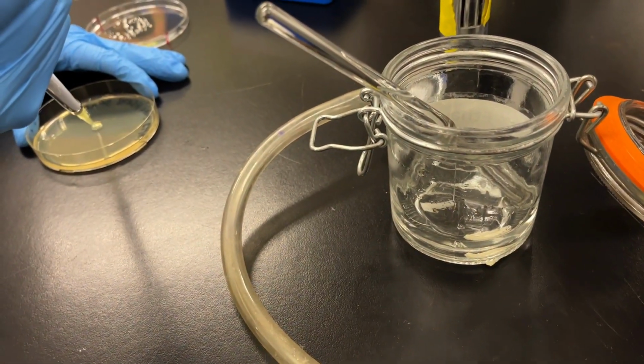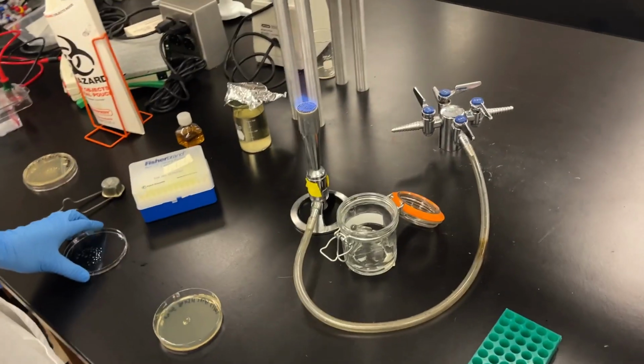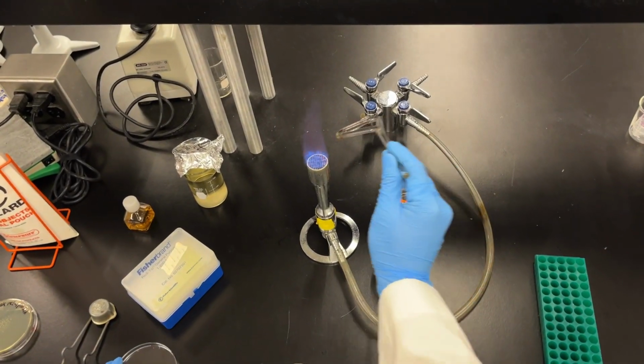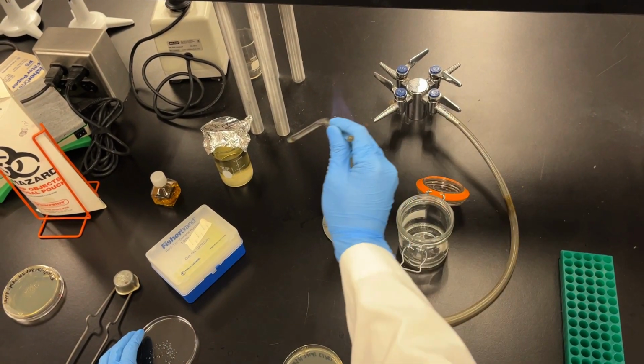Right onto the middle of the plate. And then he's got a spreader soaking in ethanol. The ethanol is going to sterilize the spreader. Simply tap it off and then pass it through the fire, making sure that the ethanol burns off. Usually I pass it twice.